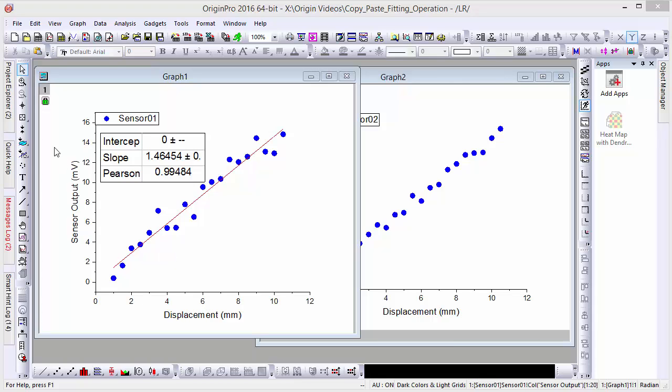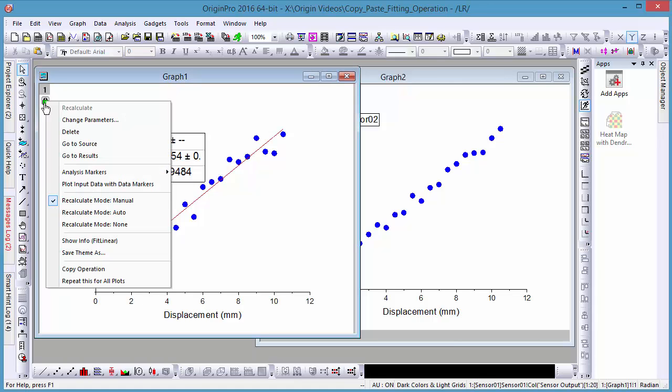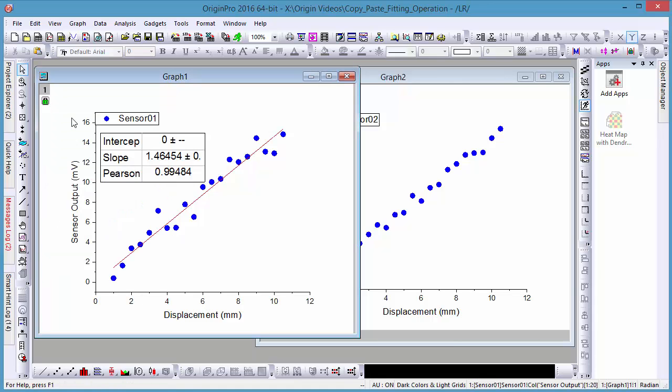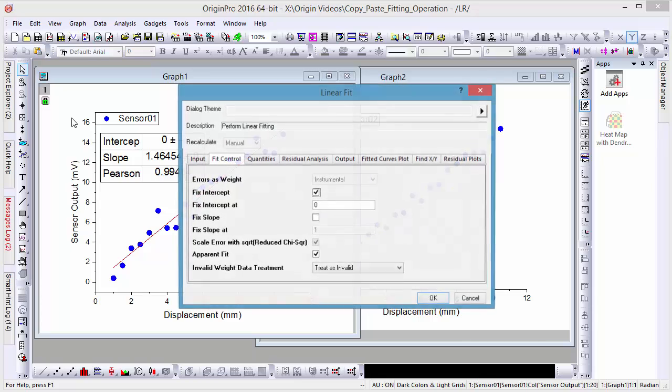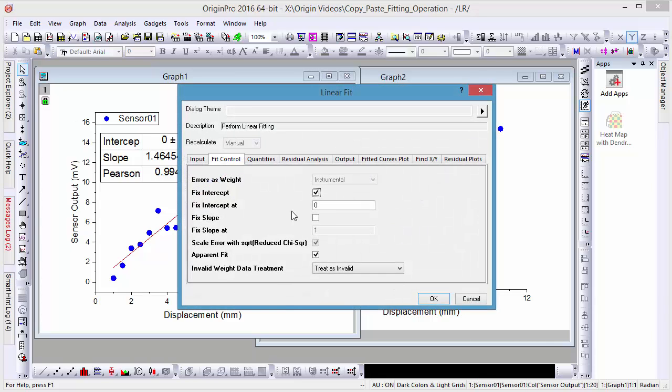Origin allows users to easily copy and paste fitting operations between graph windows. For example, a linear fit was done on a left graph with an intercept fixed at zero.